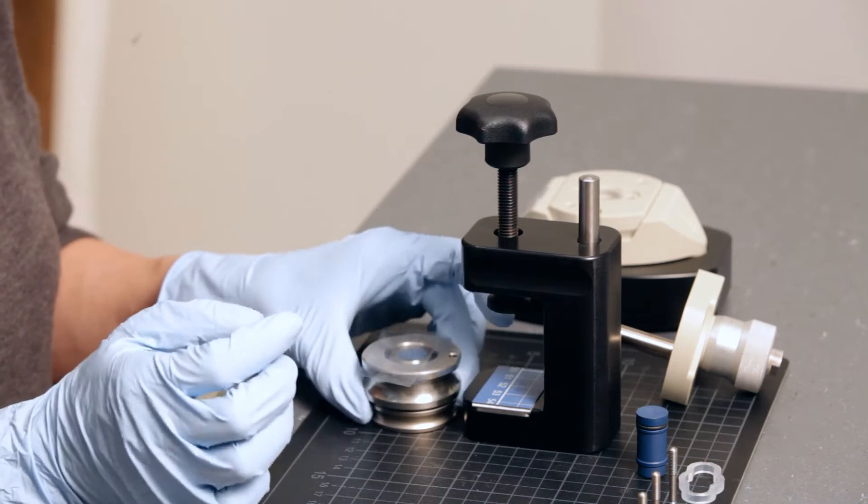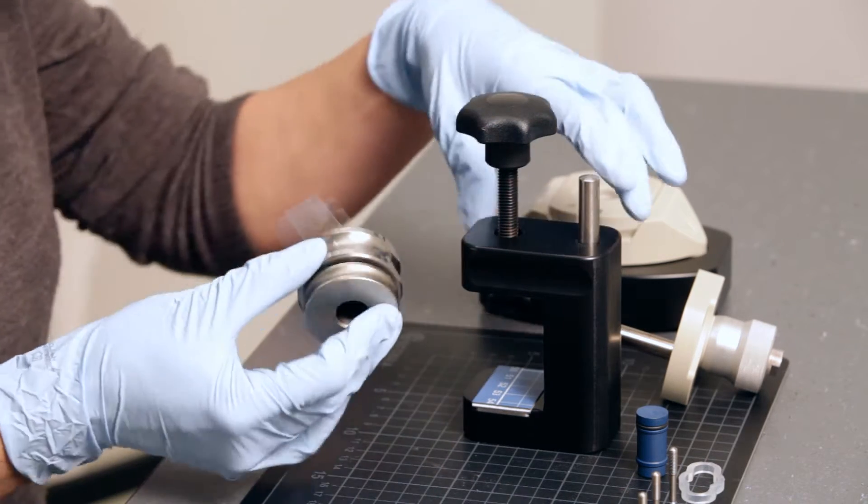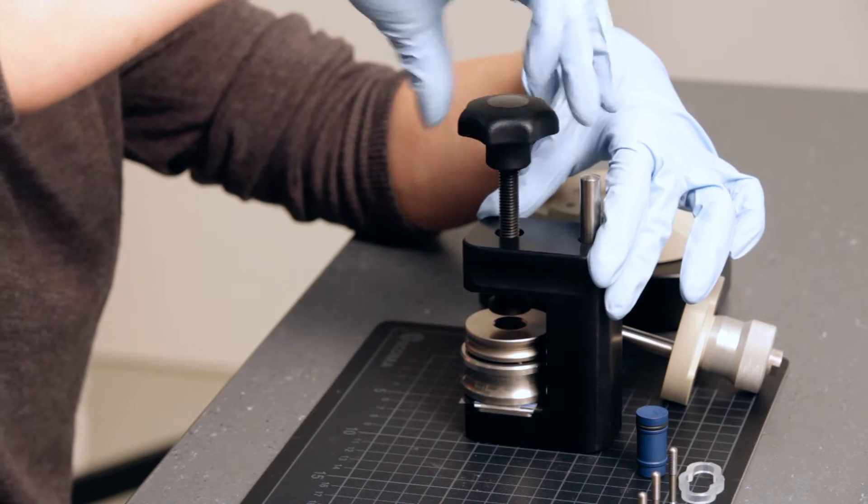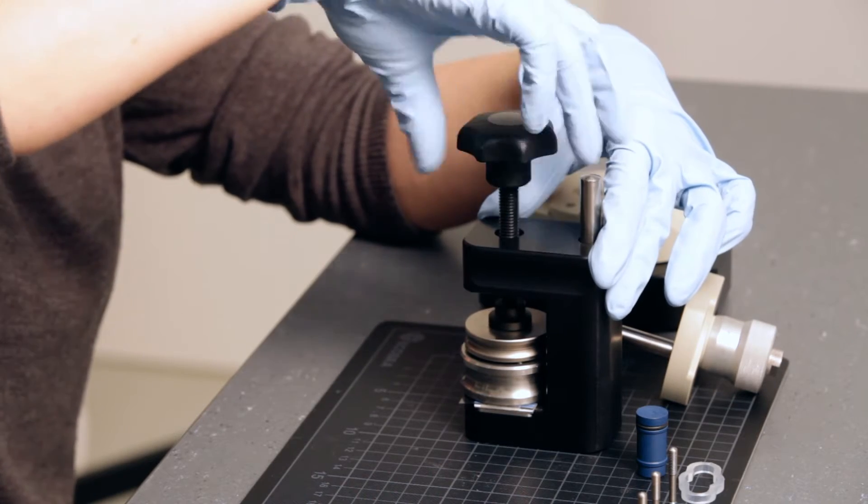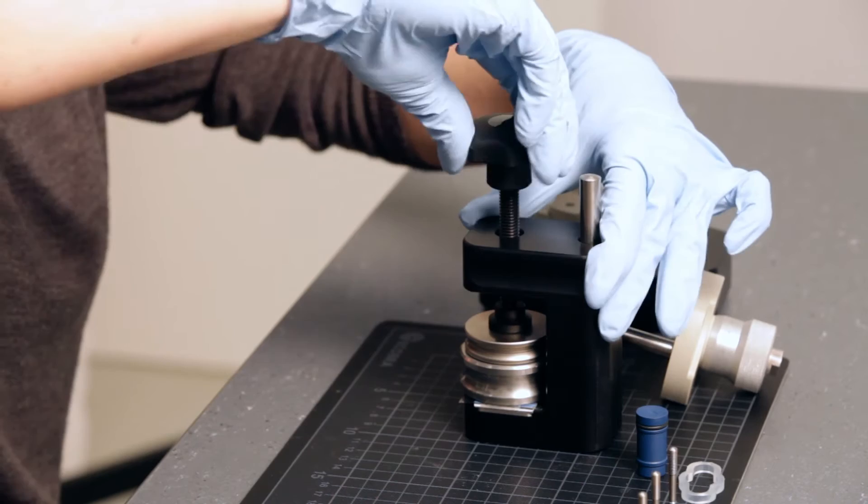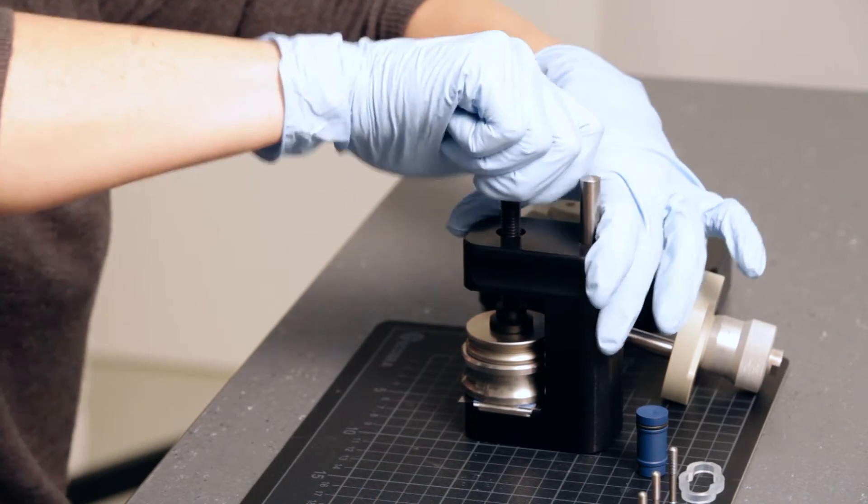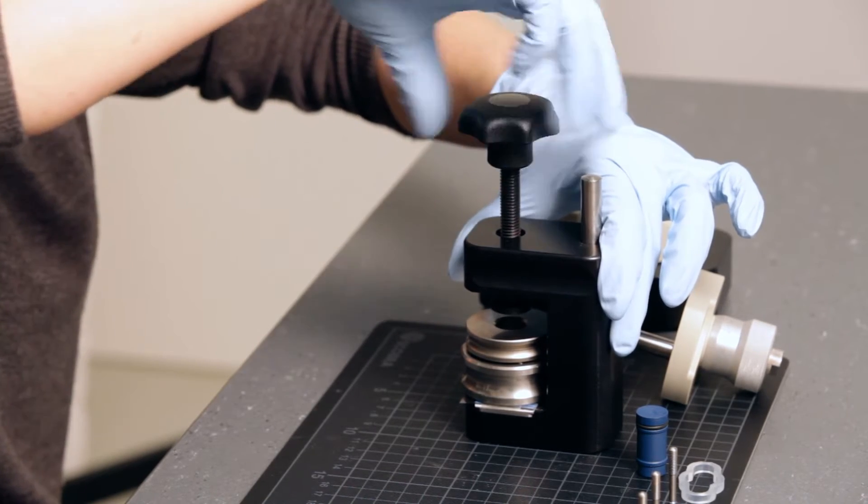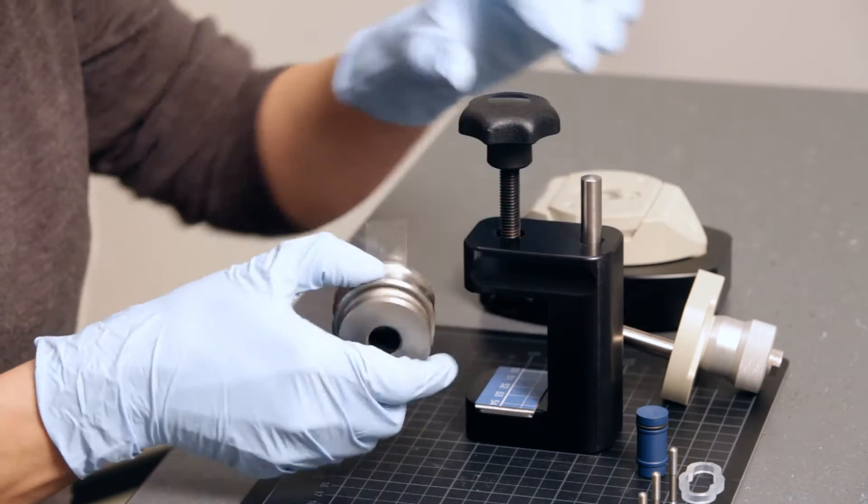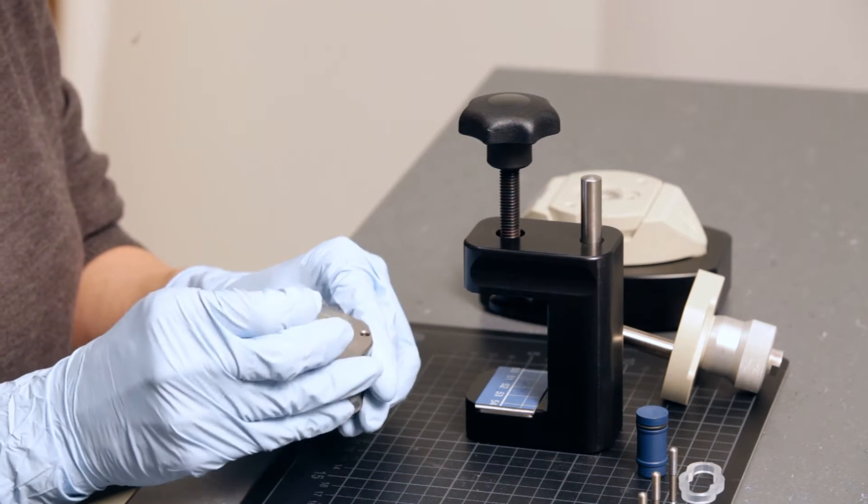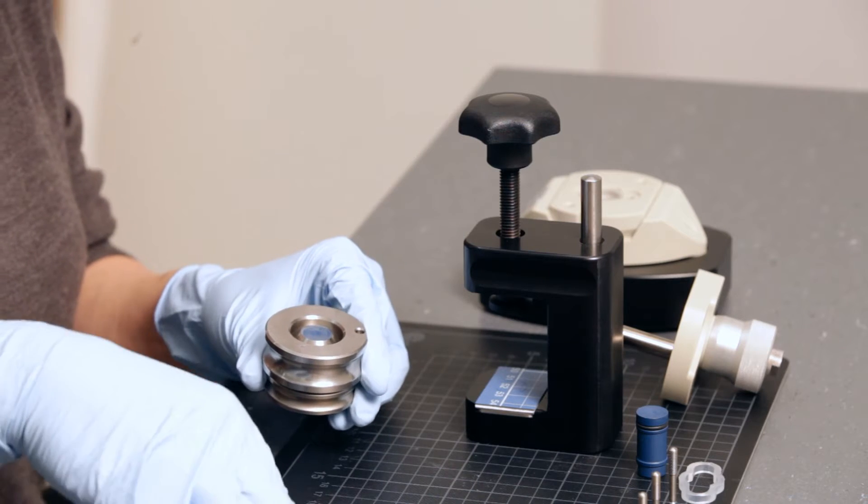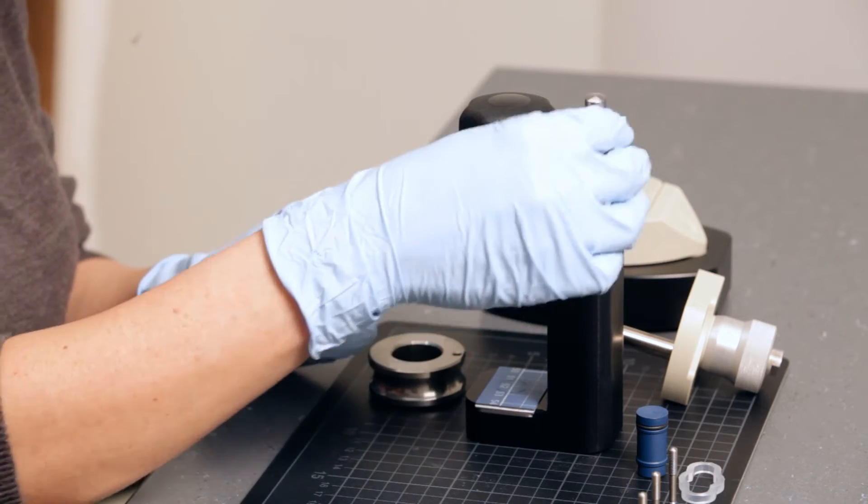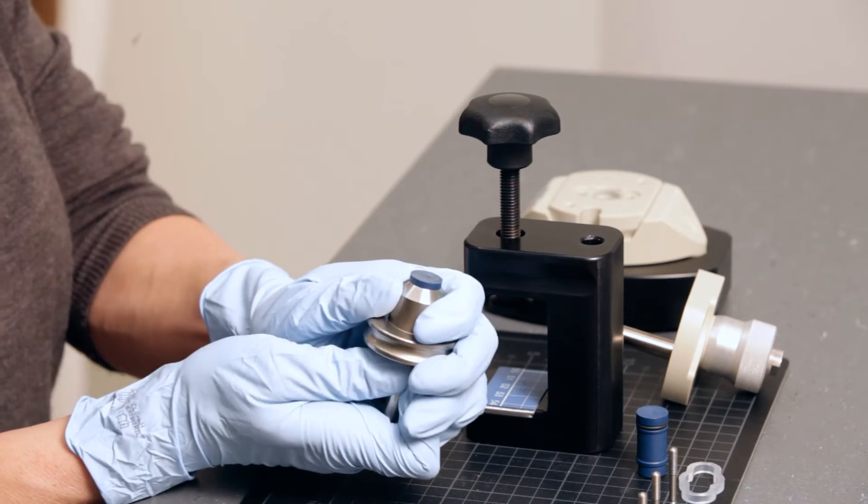Place the puncher with the sample holder and sample in the punching tool. Tighten the knob of the punching tool completely. Remove the puncher with the sample holder and the excess adhesive tape and sample. Use the metal bar to push the sample holder out of the puncher.